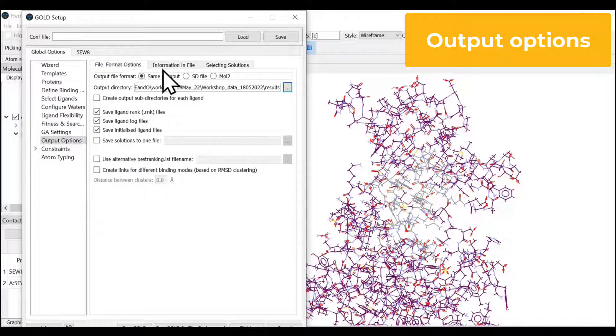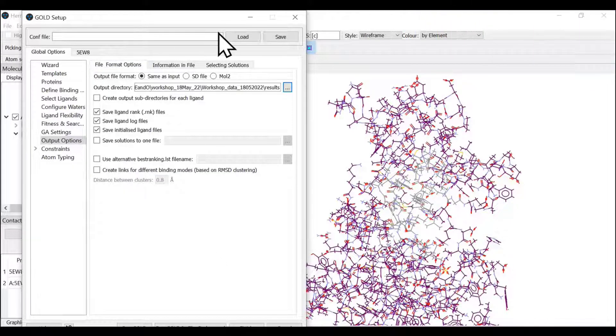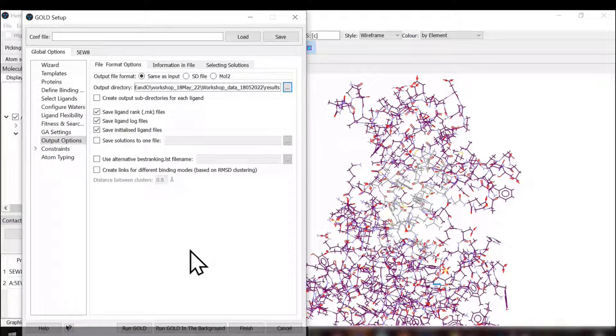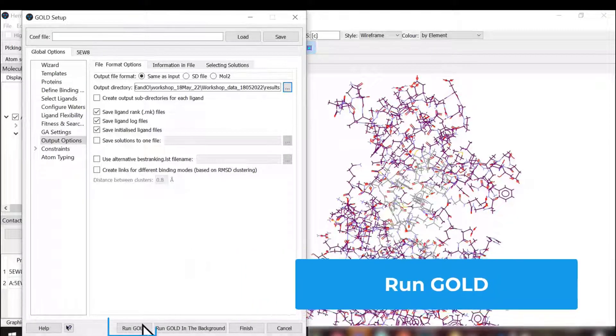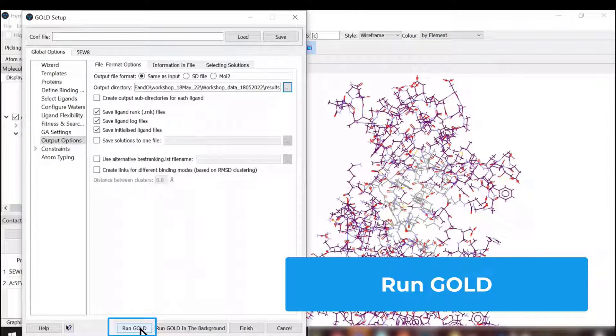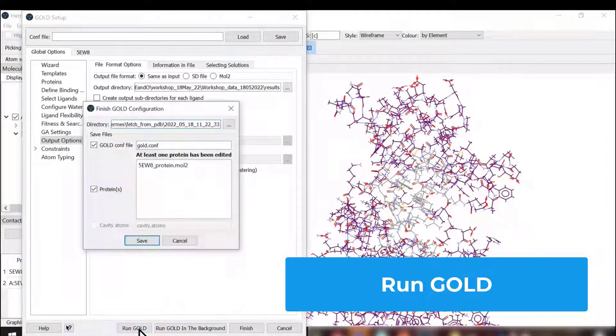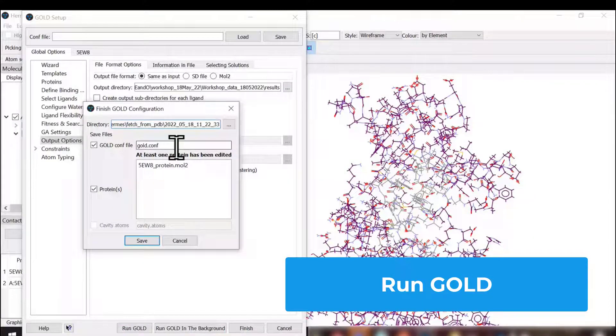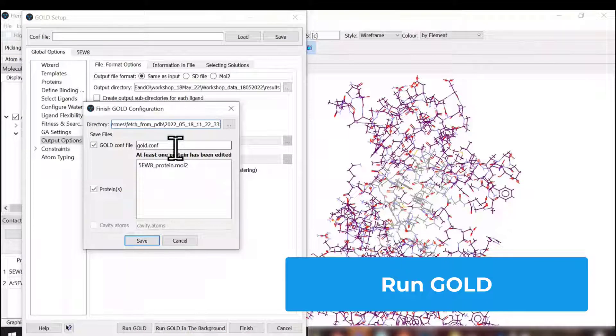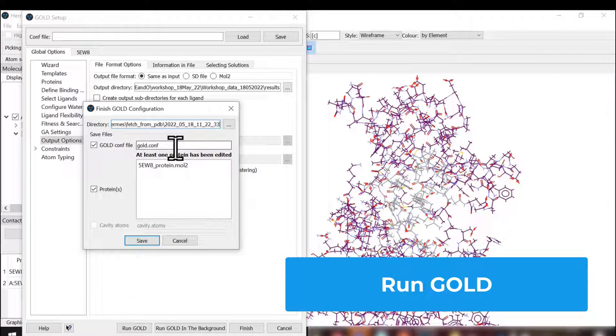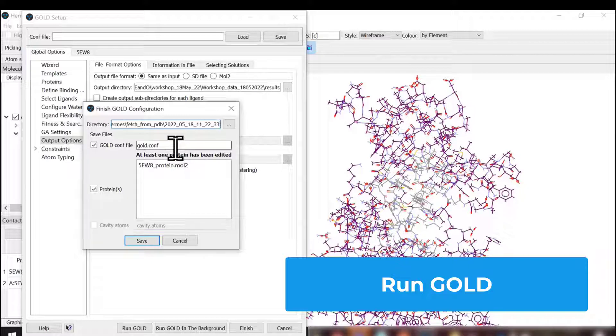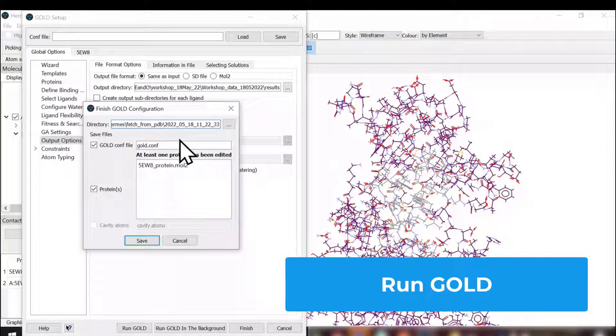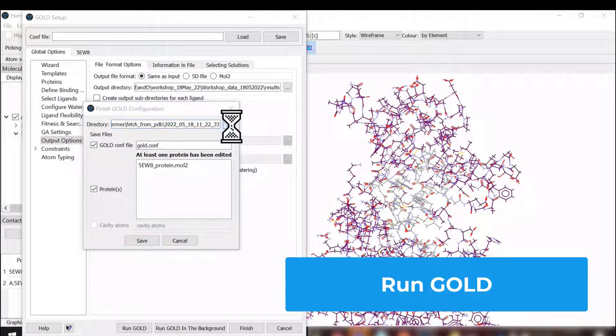We have set up all the steps and we are ready to run GOLD. Once we click run GOLD button at the bottom, it asks us where we wish to save the gold.conf or configuration file. The GOLD configuration file is a text file which collects all the data we have opted for during this setup. We're going to save this file in our working folder.